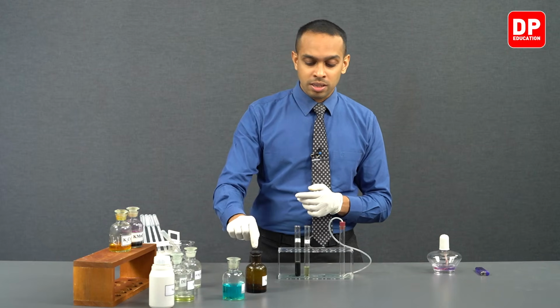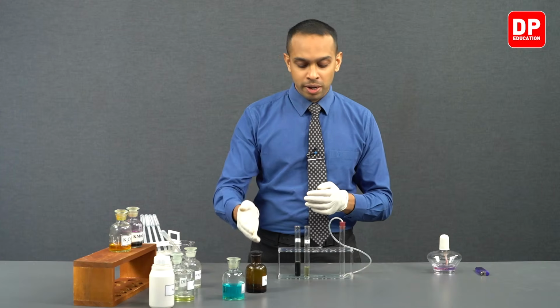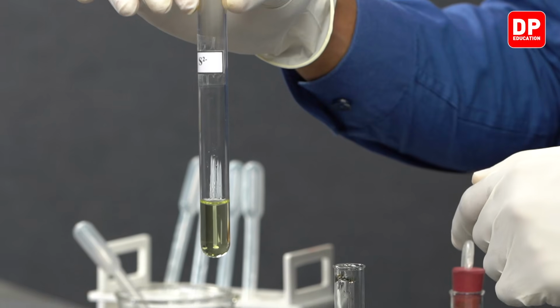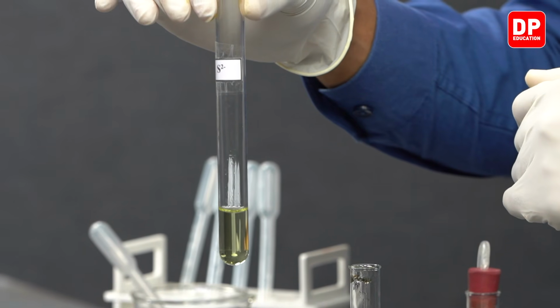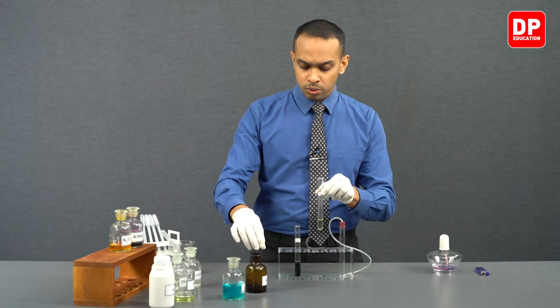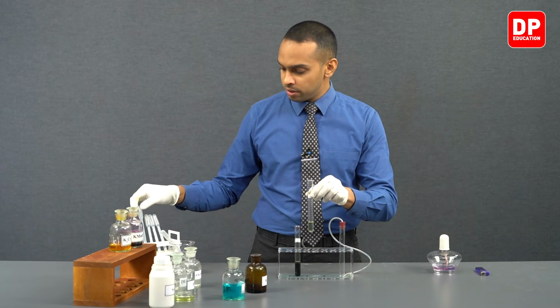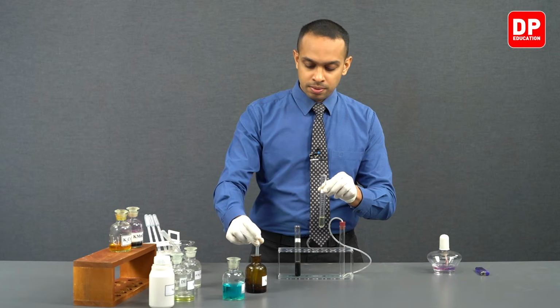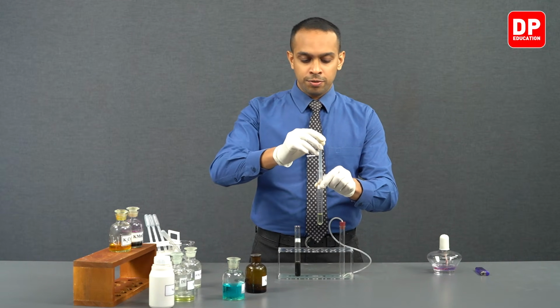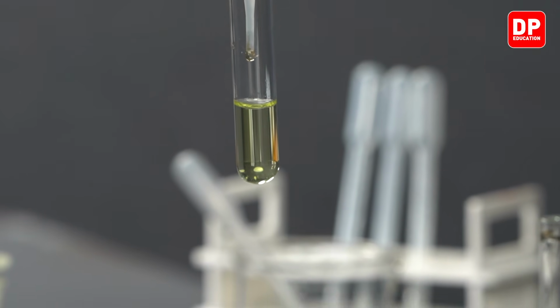So if you take this silver nitrate solution, since it contains silver 1+ ions, if you add it to our sulfide ion solution, you will observe the formation of a black color precipitate yet again. So let's take a dropper and add a few drops of silver nitrate.